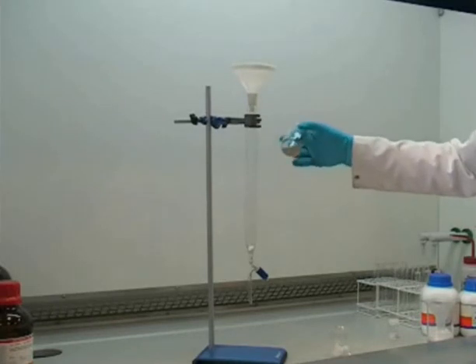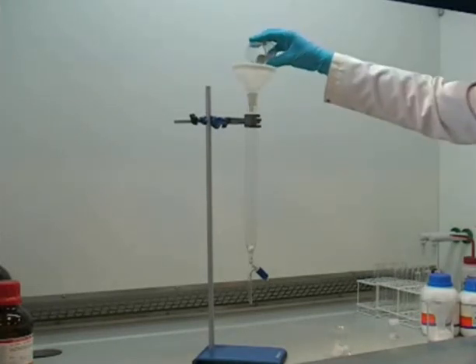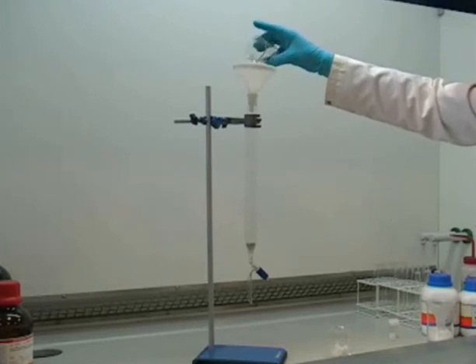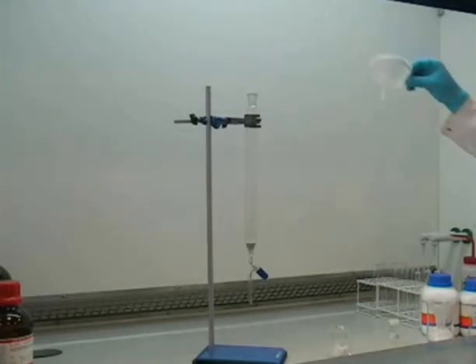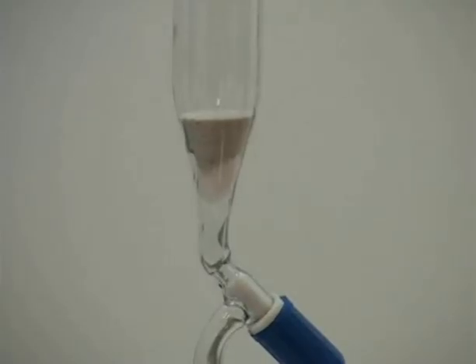Next, a small amount of sand is poured in to a depth of about 1cm. Here you can see the sand forming a level surface on top of the cotton wool.